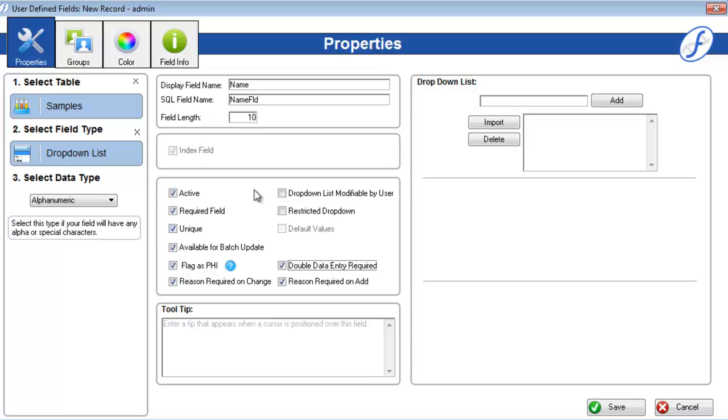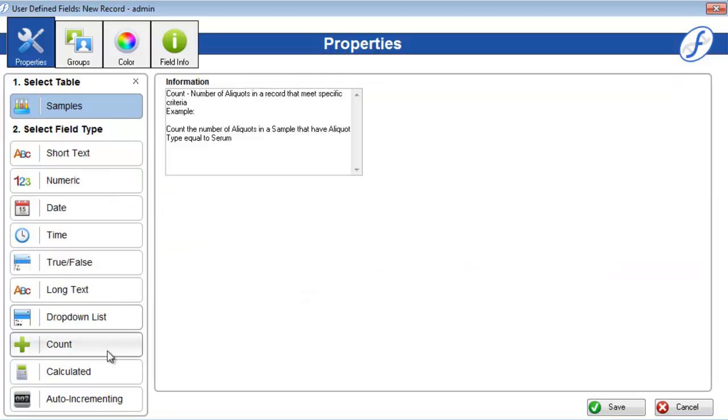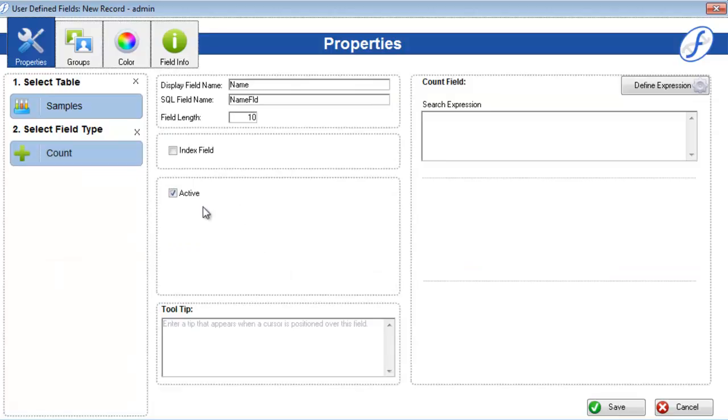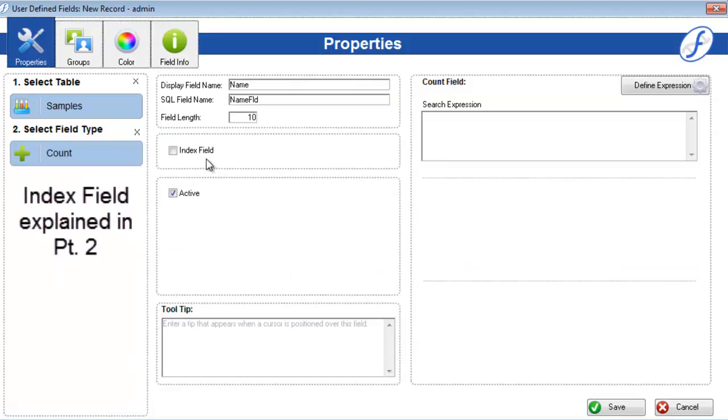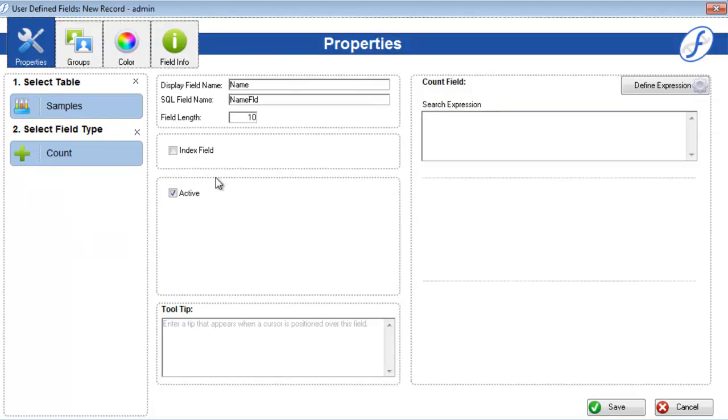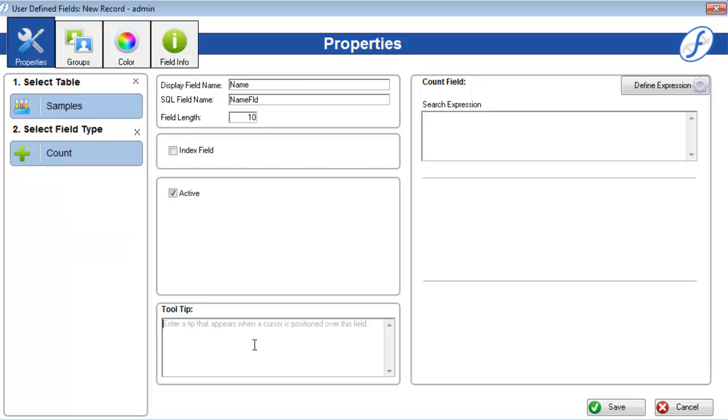For example, the drop-down list field has two exclusive checkboxes, a modifiable drop-down list and restricted drop-down, while the count type field only has the active and index field checkboxes. No matter what field type you have chosen, you can always enter a tooltip using the text box at the bottom of the screen. This will appear any time the user hovers over the field on an entry form.